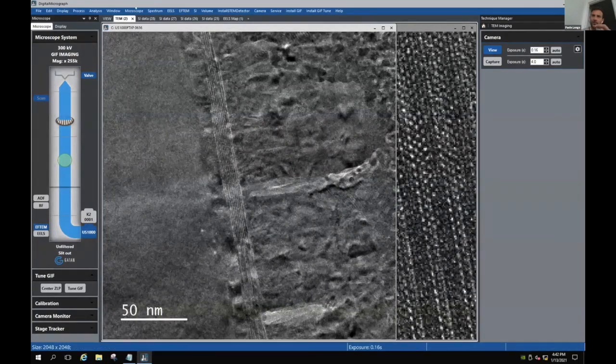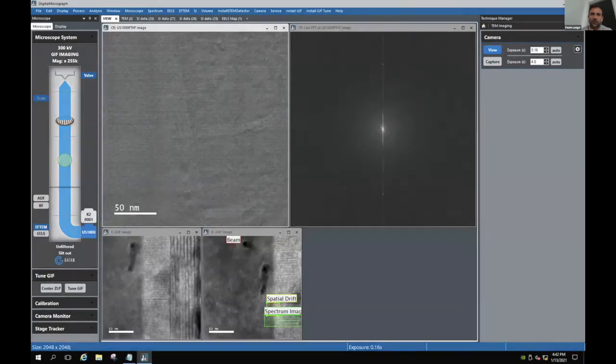So essentially you can use the K2 to monitor the dose. You look right at the bottom, you can see the dose. There's a last experiment that we could do. I mean, we could go back to the K2. I can insert the K2 now.